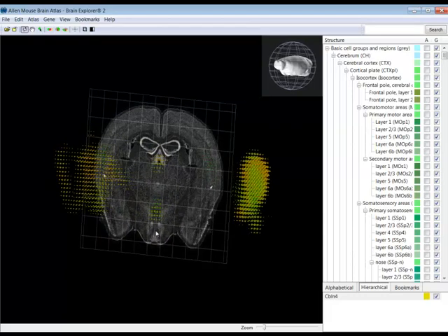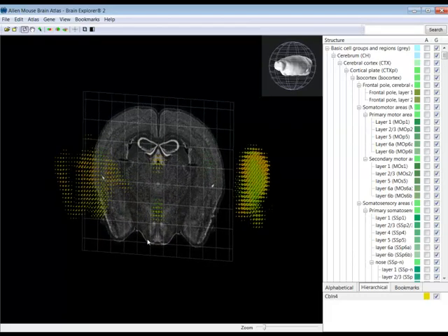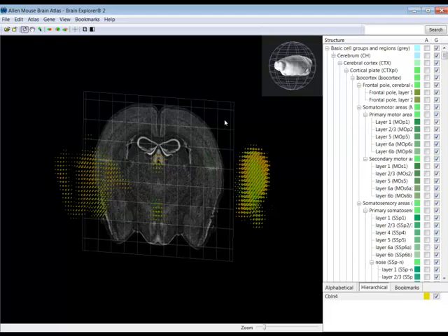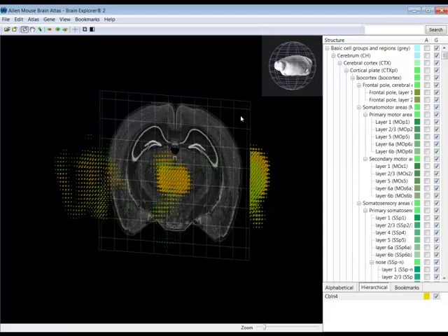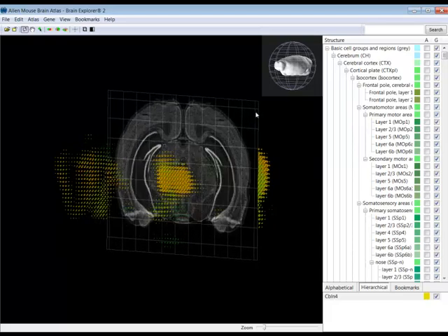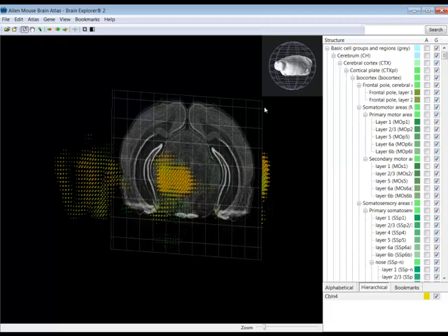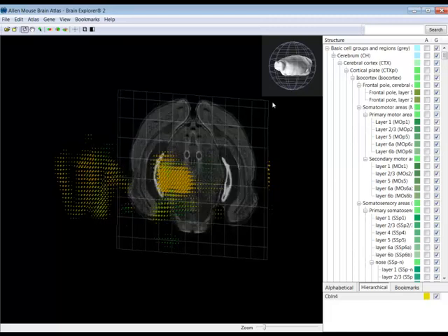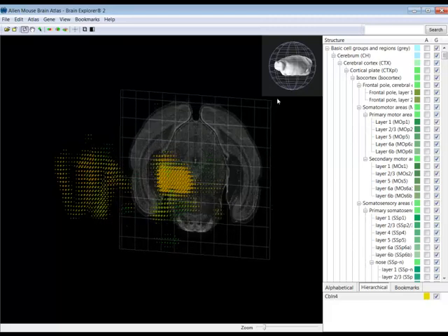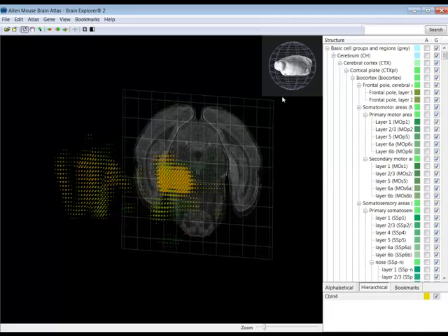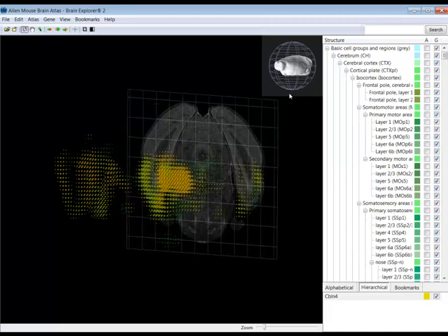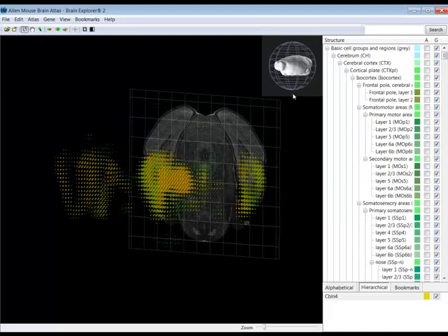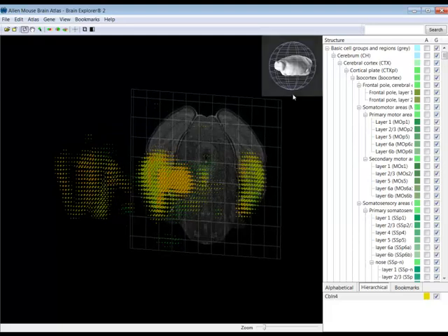Now you can move the section across the brain by right-clicking on the Nissl section and dragging in the perpendicular direction. You'll want to try this a couple times as it takes practice. Here I'm looking for the Nissl section in the area of the entorhinal cortex.